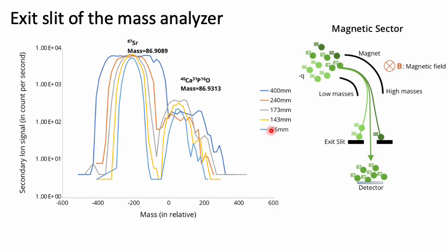If we have a really small exit slit that is the same size or smaller than the beam going into it of what you actually want to analyze, then you get a really pointy peak. If it's too big, then the broadening of the peak you want to analyze starts to overlap with the potential interference next to it.